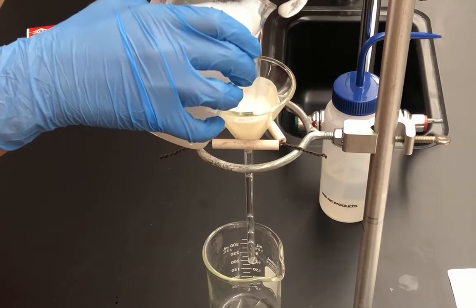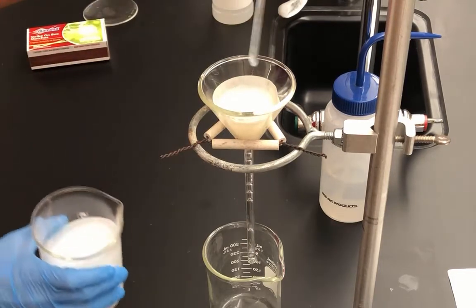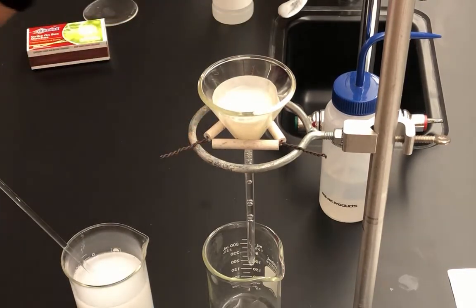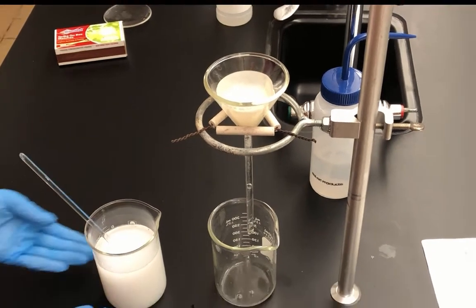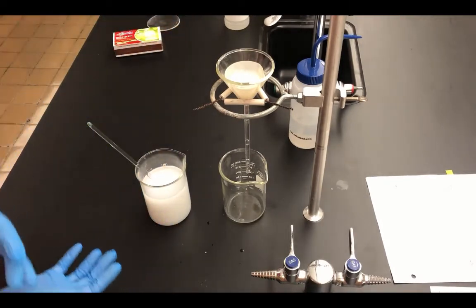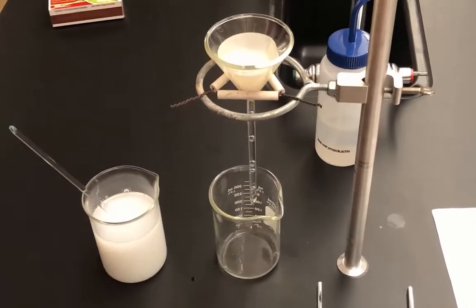That prevents splashing. So I'm going to pour some down, but I want to make sure that I'm not getting the liquid level up above the piece of filter paper. And I'm going to continue to filter this. I'm going to continue to go through. At the very end, when my beaker looks empty, I'm going to rinse it with some distilled water, and then I should eventually have a solid in the filter paper.